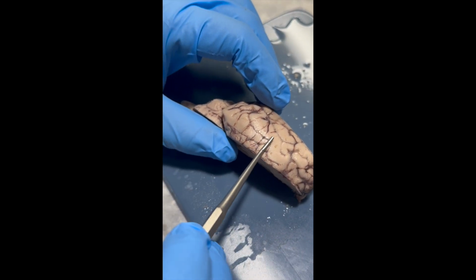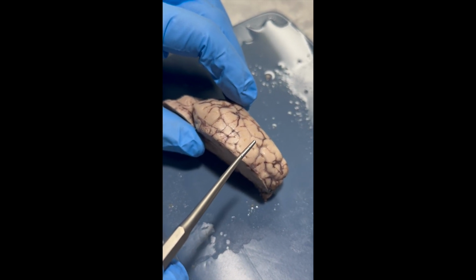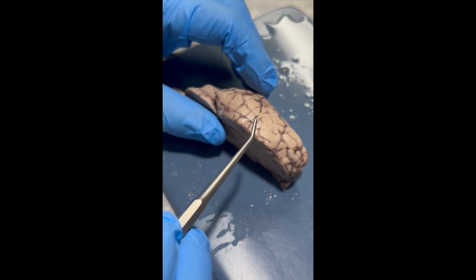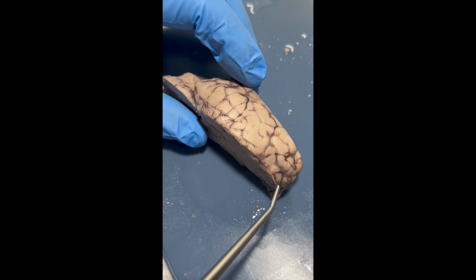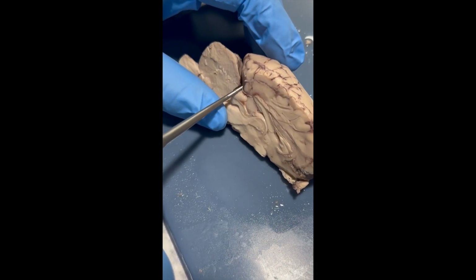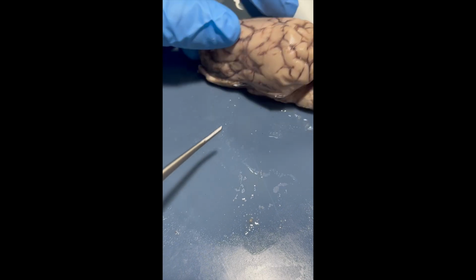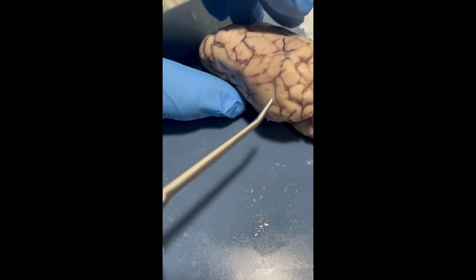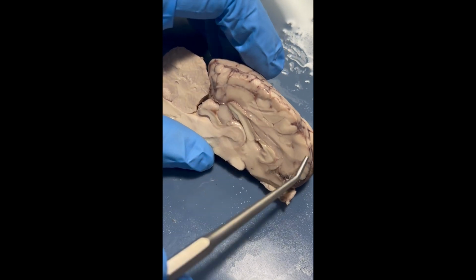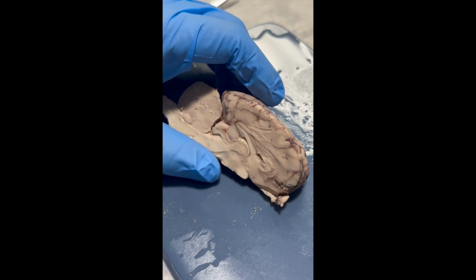The parietal lobe is just posterior to the frontal lobe. The parietal lobe is responsible for sensory perception. Going back to the frontal lobe, it is responsible for things like voluntary movement, self-control and impulse control. The occipital lobe can be found back here by the cerebellum. This processes visual information, and then the temporal lobe can be found on the side here and mainly processes sounds and memories. The cortex is just the outermost layer of the cerebrum. It contains all of the gray matter within the brain.